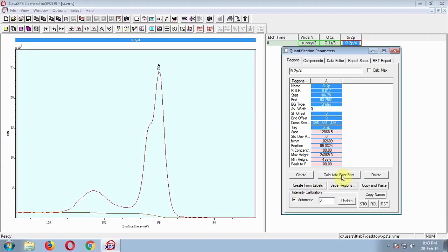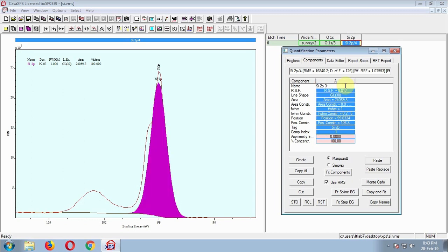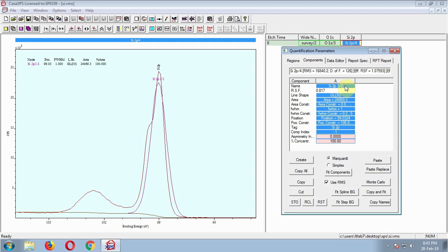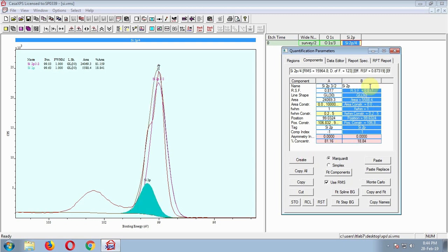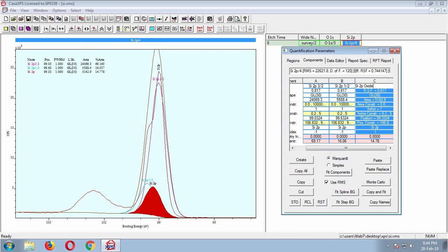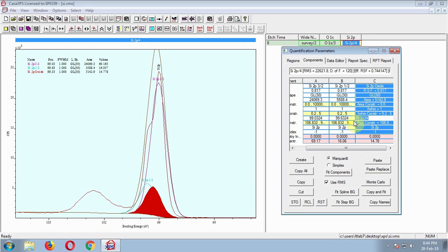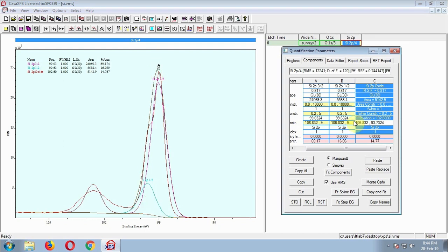Let's try these line shapes one by one. By looking at the shape we can assume there are three peaks, and we know from the previous analysis there could be three peaks: two P3/2, two P1/2, and one oxide peak. Let's make it. This is the first component — it's 2P3/2. Next, 2P1/2. Last one, 2P oxide. The position is not correct — let's correct it. It must be here: 102.6. Now we can check how they fit to data.